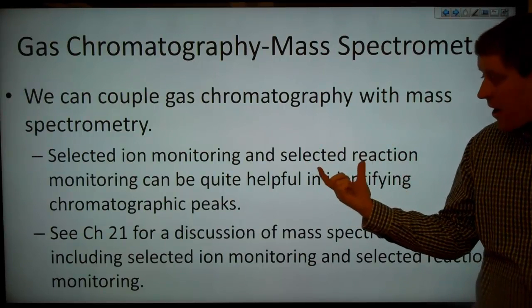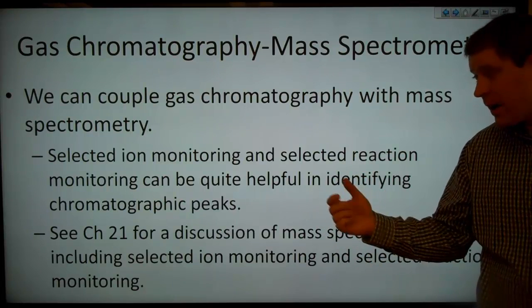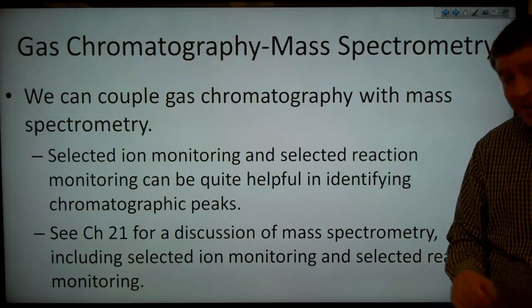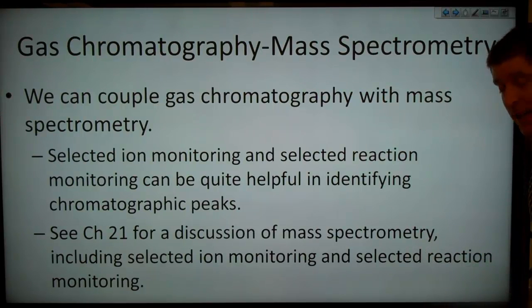And selected ion monitoring and selected reaction monitoring can be quite helpful in identifying chromatographic peaks. Now, see Chapter 21 for a discussion of mass spectrometry, including these selected ion monitoring and selected reaction monitoring techniques.